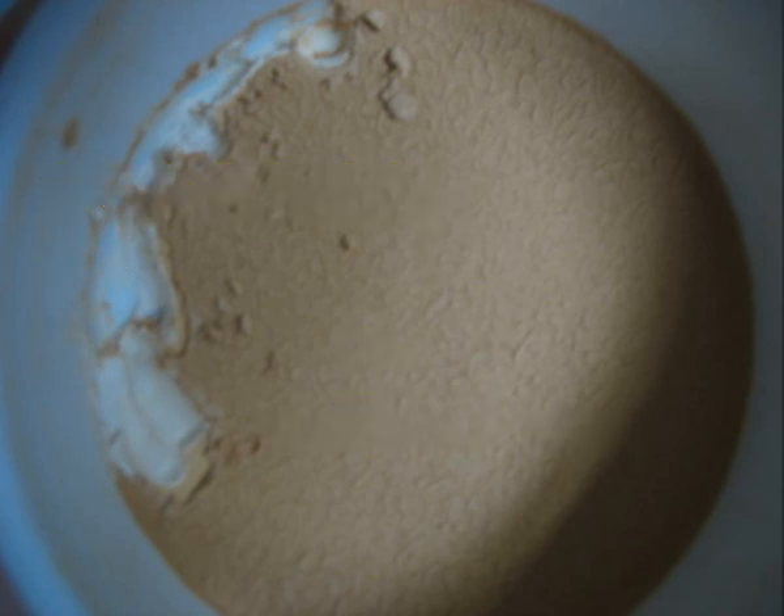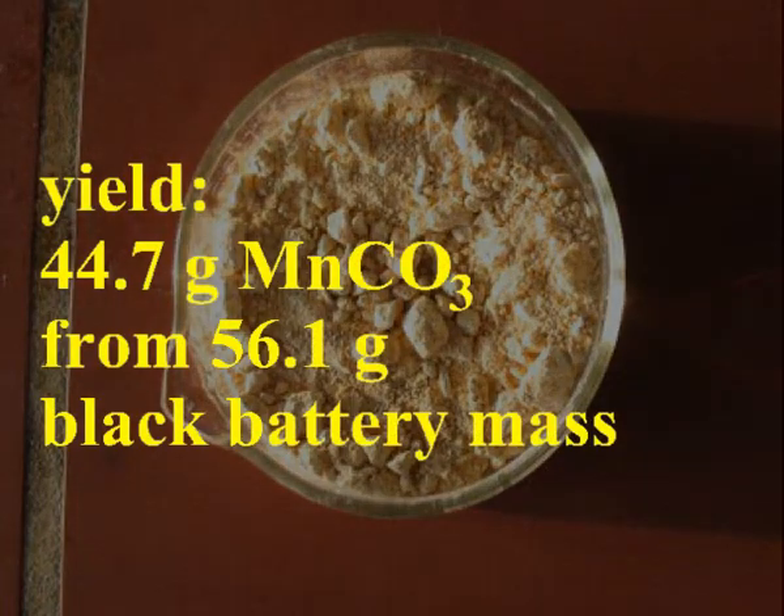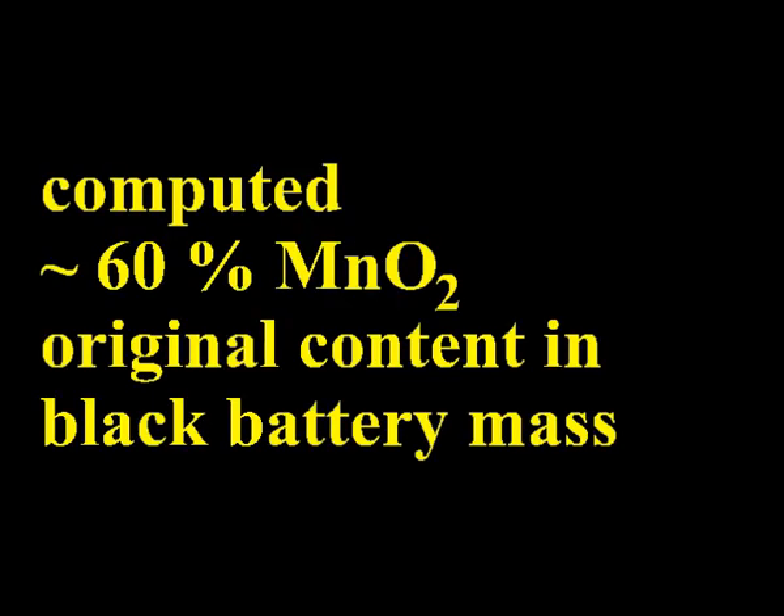Wash the manganese carbonate with distilled water, remove it from the filter and let it dry until the weight remains constant. I got about 45 grams of manganese carbonate out of one battery, which suggests an original content of 60% manganese dioxide in the black battery mass.